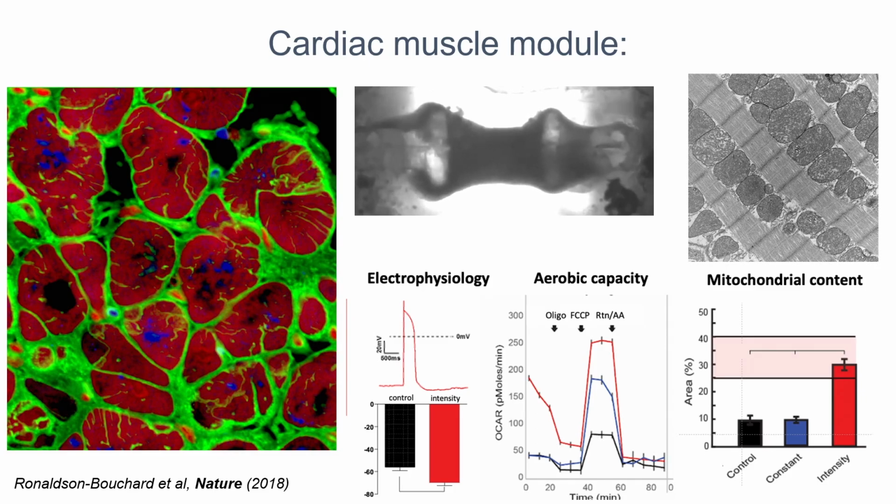For this to happen, it was very important to find out that we need immature cardiomyocytes, which was completely opposite to what we were doing for many years in the field, always thinking like more mature cells are better. Yes, they are, but actually if you are developing a tissue, then immature cells are better responding to stimulatory factors.